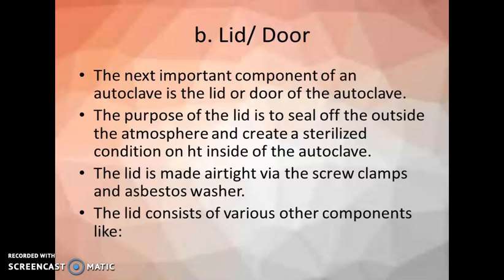The lid is made airtight through screw clamps and an asbestos washer. The asbestos washer is present inside the lid, and there are also screw clamps.